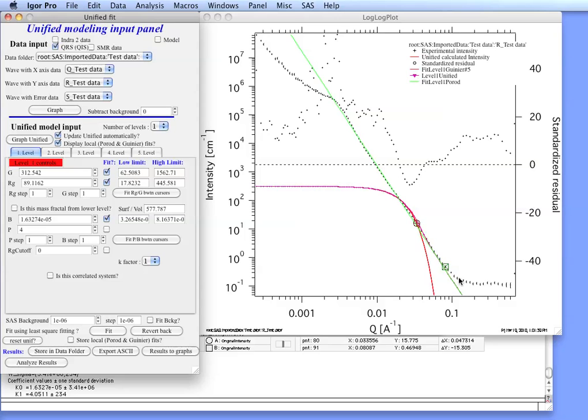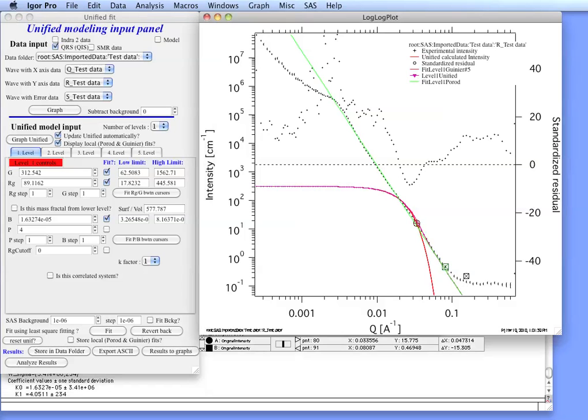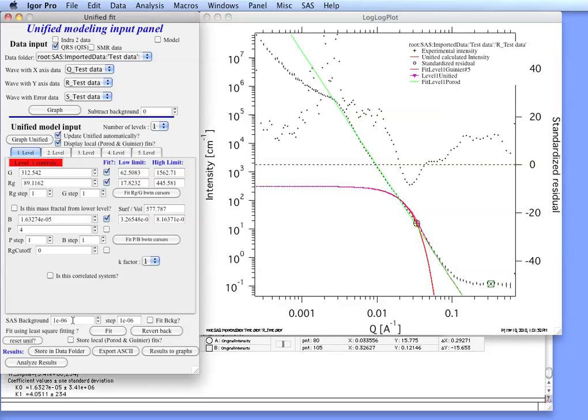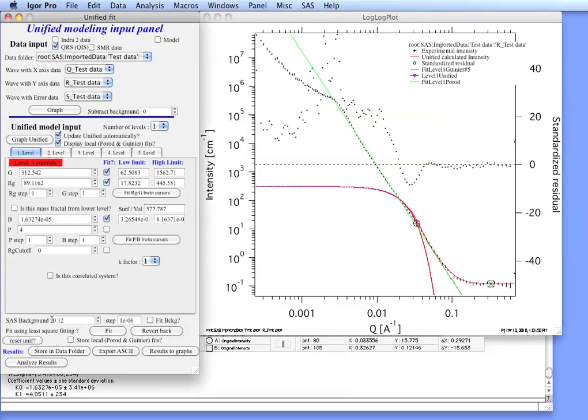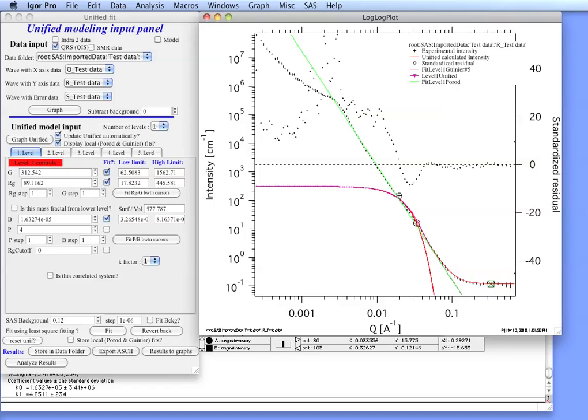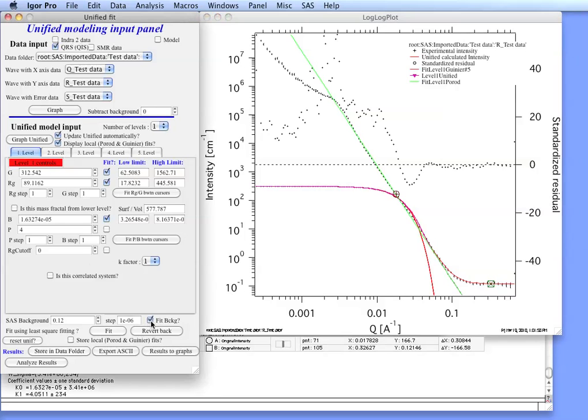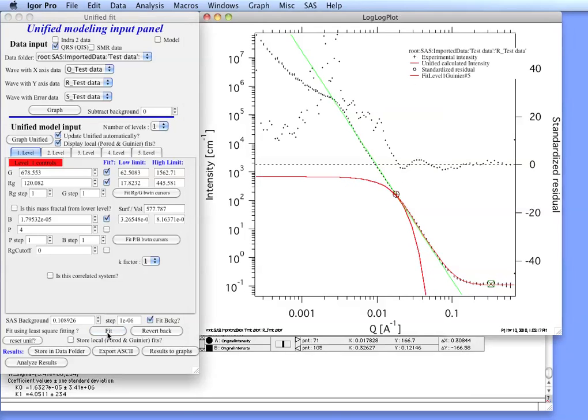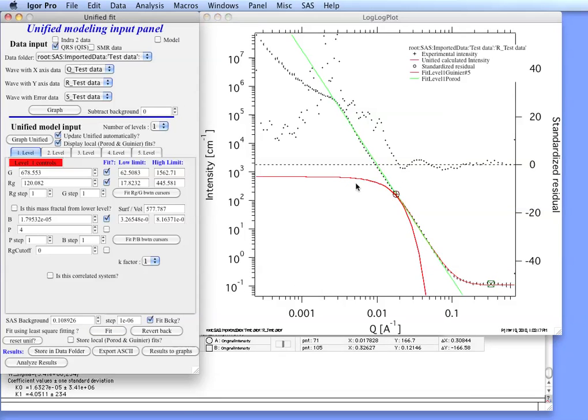The next thing is we need to model this flat background here. If we move the cursor out here you can actually see it's about 0.12. So in the SAS background we can type in 0.12. And you can see that it nicely now follows in there. And we can optimize all the parameters at once by selecting the right Q range in which we believe this level should define the data. Selecting also the background. Now we're going to fit G, RG and B. We can do fit. And you can see that we have fit the data quite nicely.